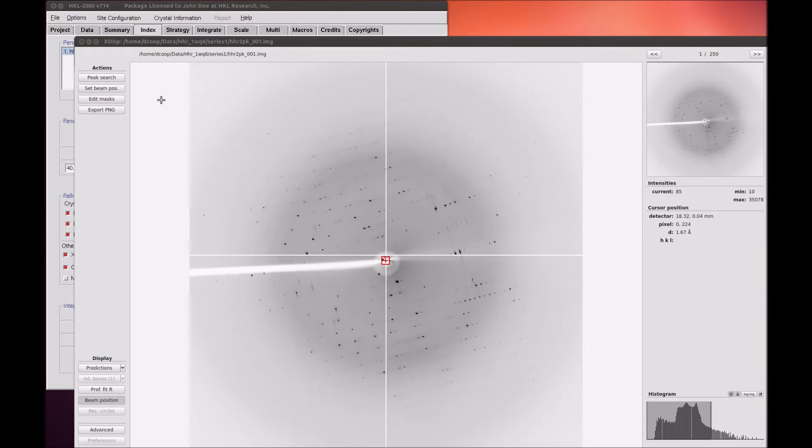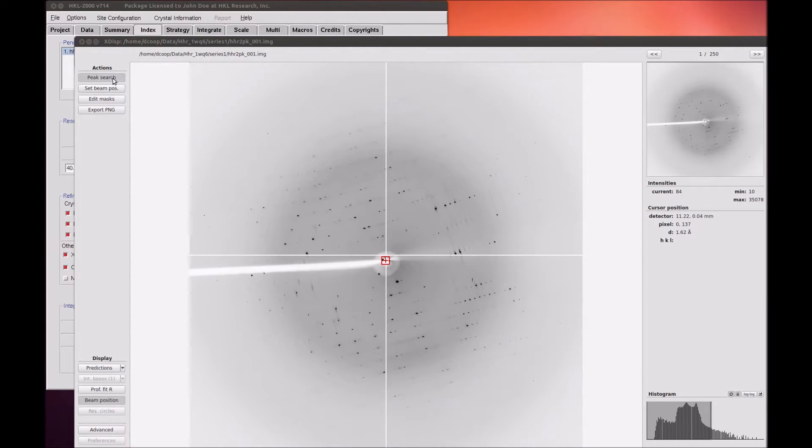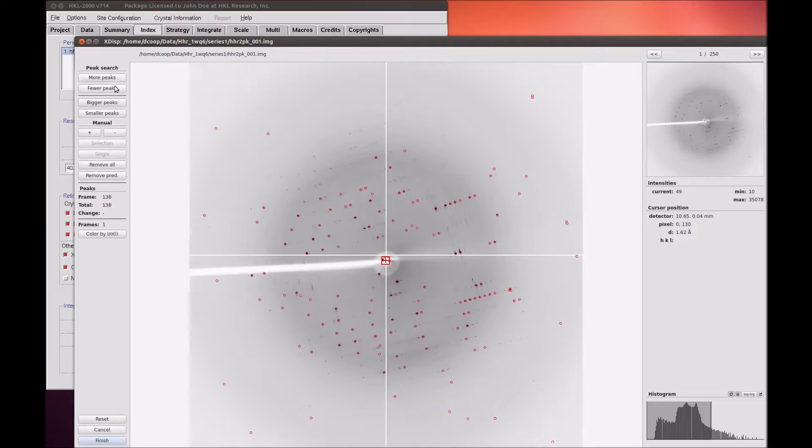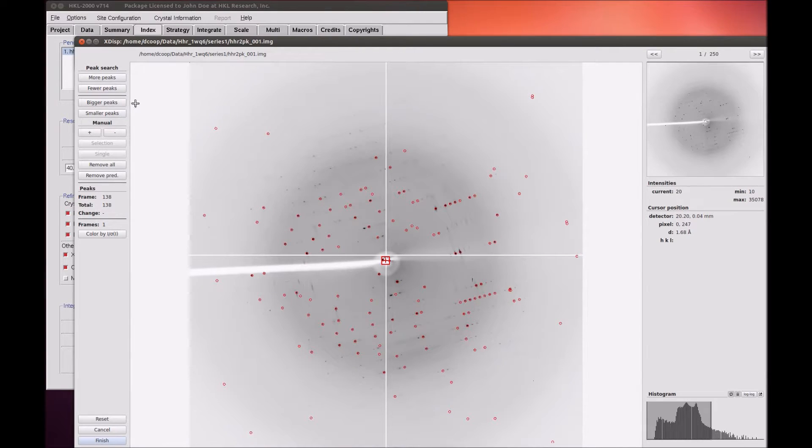To perform a manual peak search, use the peak search button in the top left. The buttons More Peaks, Fewer Peaks, Bigger Peaks, and Smaller Peaks work as before, and now have a pop-up description if you hover over the buttons.